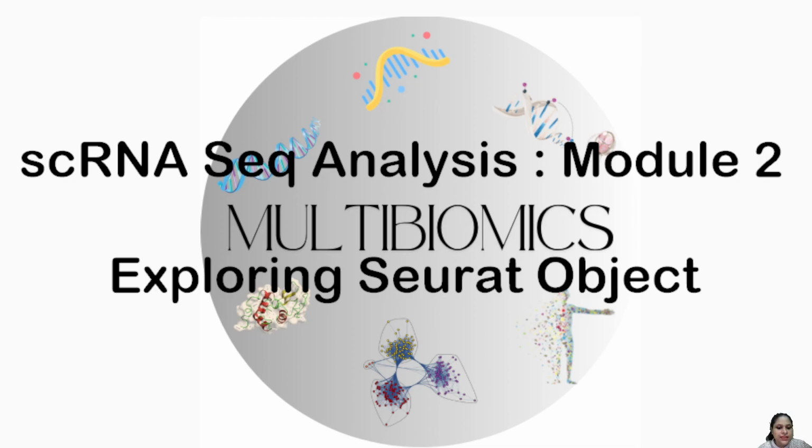So without any further delay, let us start with the second module. Once again, welcome to this hands-on tutorial on single cell RNA sequencing data analysis using the Seurat package in R. In this session, we will explore key aspects of a Seurat object, focusing on understanding the variability in molecular counts across all the cells present in our dataset. We'll be visualizing gene expression patterns, and we'll be navigating the complex data structure within the Seurat object, right?